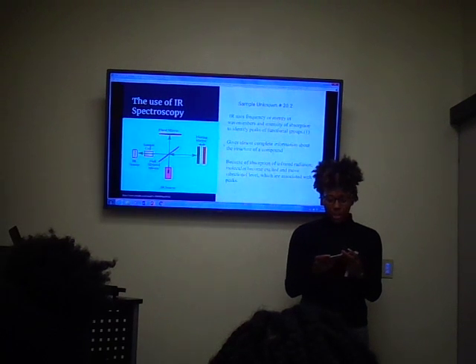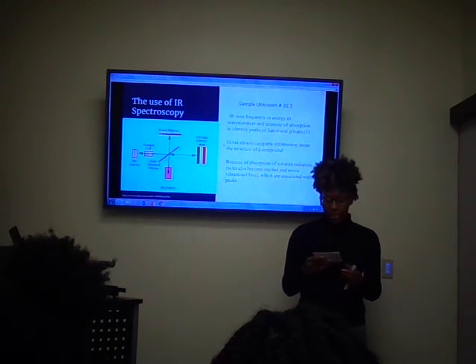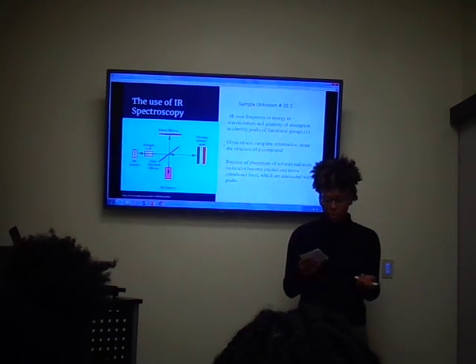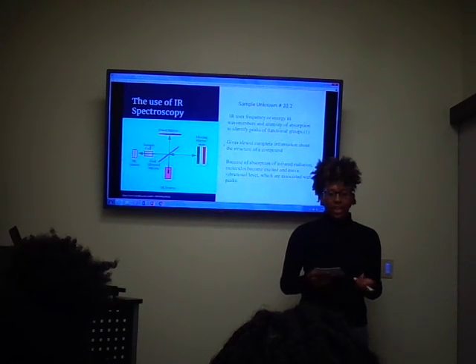According to the Concepts of Chemistry Lab Manual, the IR uses frequency, energy, wave numbers, and intensity of absorption to identify peaks. Using this technique, it gives almost all of the information we need. During this technique, the molecules get excited, so it shows vibrational levels.